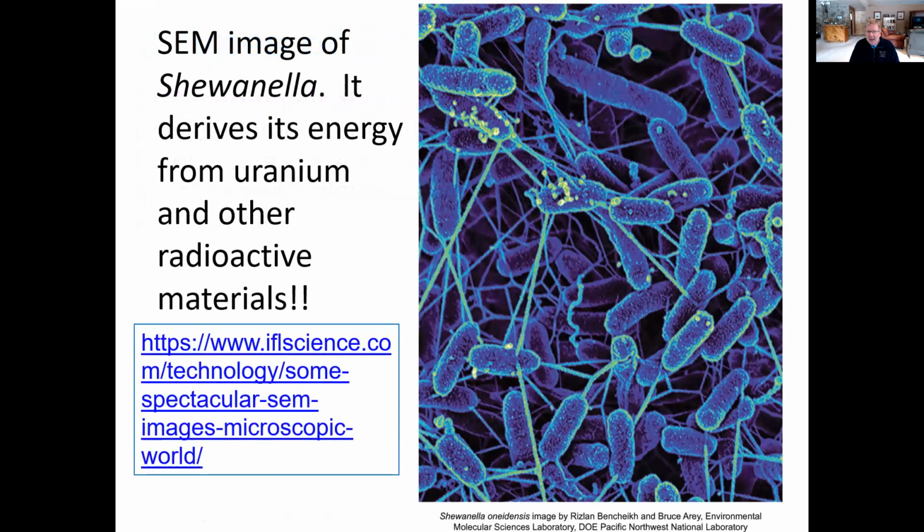So here we're looking at a scanning electron micrograph of some bacillus-shaped, rod-shaped bacteria whose genus is Shewanella. That's how you pronounce it. I'm not familiar with Shewanella, but there's what it looks like, and you can see that these definitely give you a sense of almost, I won't say three-dimensionality, but sort of like three-dimensional.